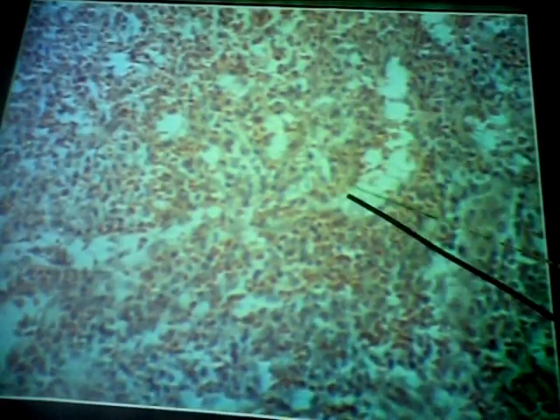Okay? Where are the cords? Splenic cords. They're all over. They're just everywhere. All of this. That's what surrounds the cavities, which are the sinuses. So these are the sinuses, these are the cords. Okay? And again, what they are is collections of cells that surround the sinuses. Lymphocytes, macrophages. What's the spleen do?